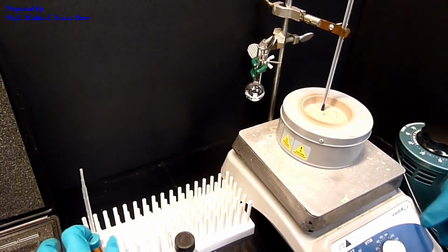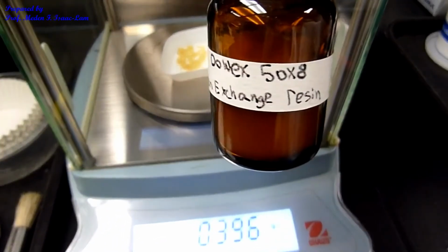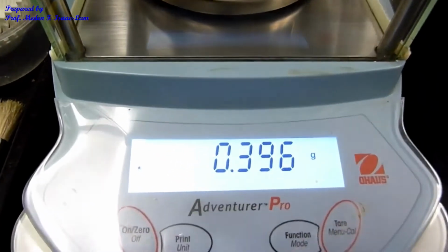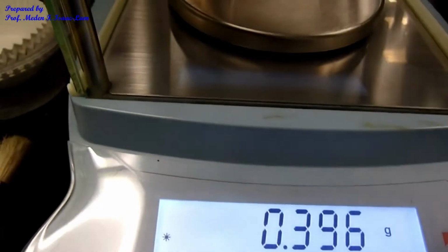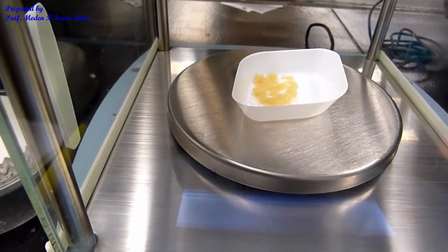And I'm also going to add the DOWEX. So the catalyst is called DOWEX. This is actually a resin. So I already measured approximately 0.4. So right now the weight is 0.396 grams of the DOWEX. So I zeroed the plastic weighing boat, and then DOWEX is now inside. And this is the catalyst.